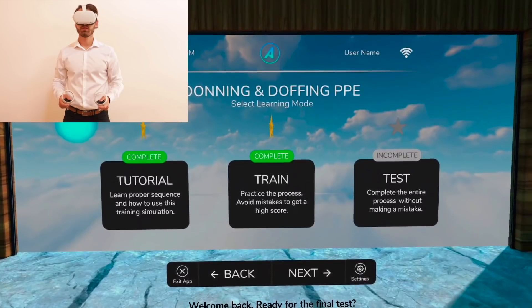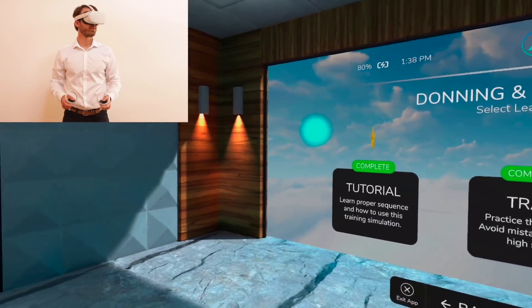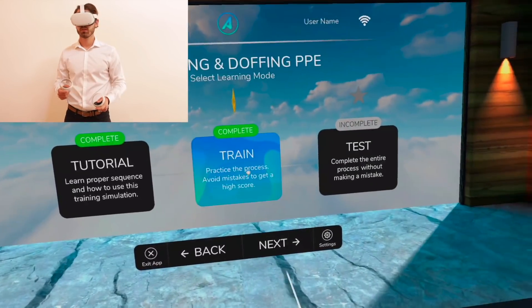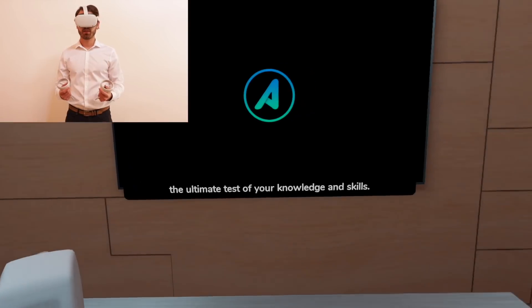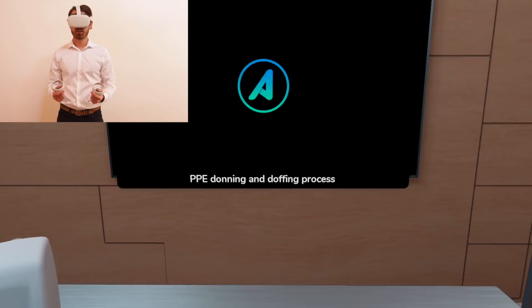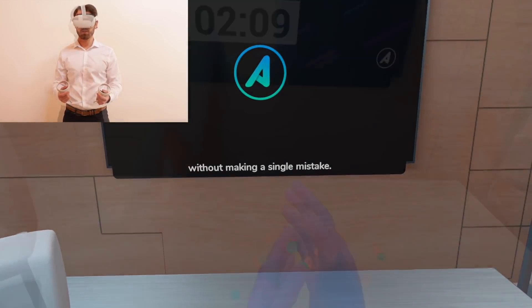Welcome back. Ready for the final test? If not, you can always repeat the training or tutorial. Welcome to the final exam, the ultimate test of your knowledge and skills. You must perform the entire PPE donning and doffing process in less than 3 minutes without making a single mistake.